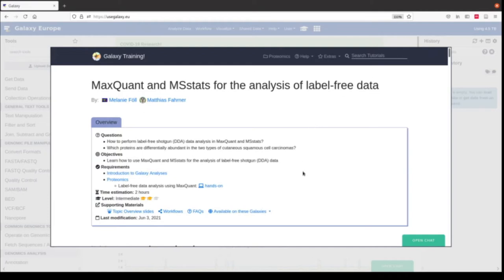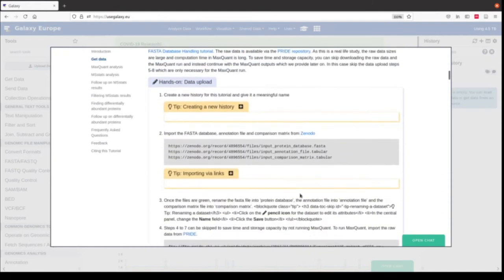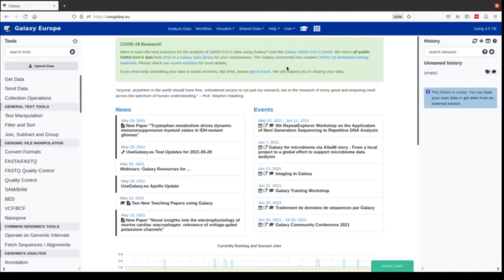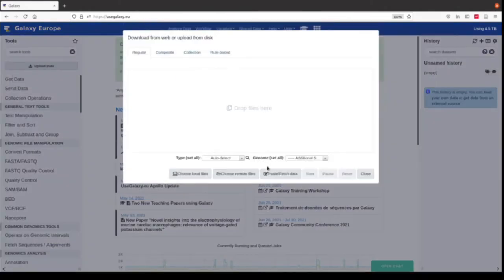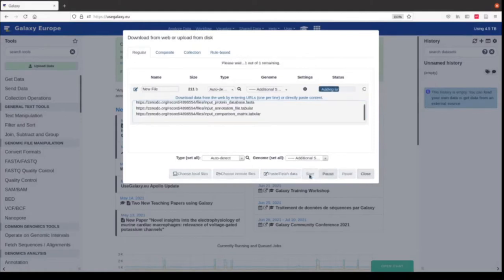We will immediately start to upload the data because it might take some time, and I will explain more about our training while we are waiting for the files to upload. Part of our files is deposited in Zenodo and we can just copy the links by clicking on the copy symbol, then go to upload data and paste the links in. Press start and close.